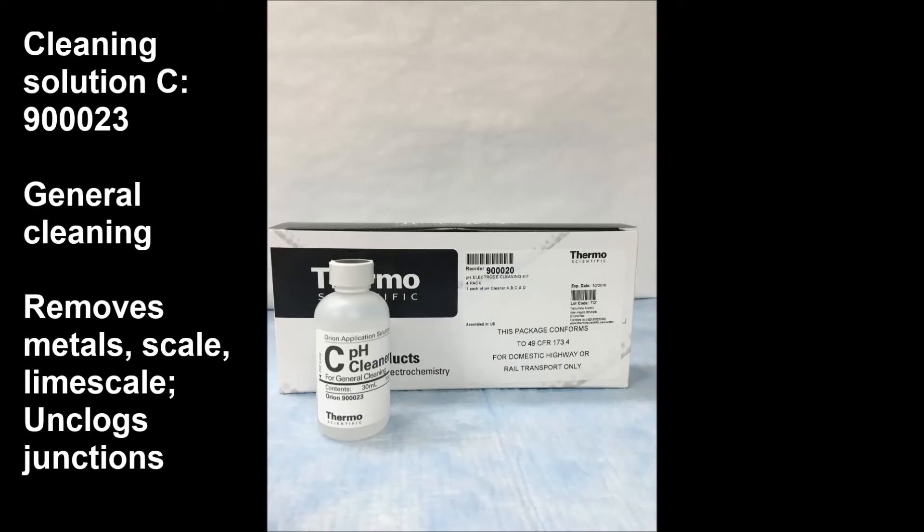Cleaning solution C is our general cleaning solution. This is a hydrochloric acid cleaning, and it removes metals, scale, lime scale, unclogs junctions, or is used for just general cleaning maintenance.